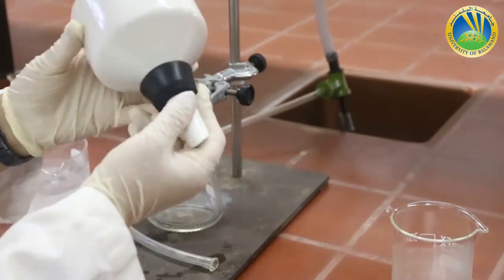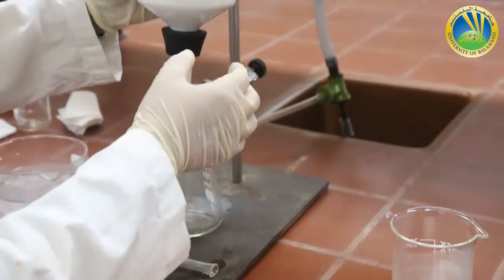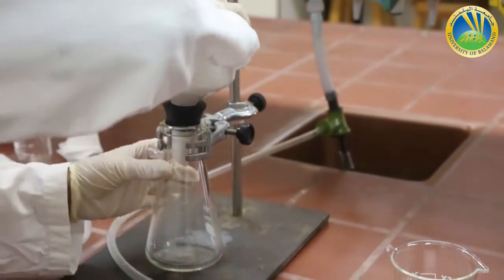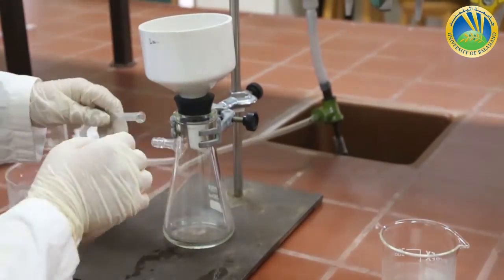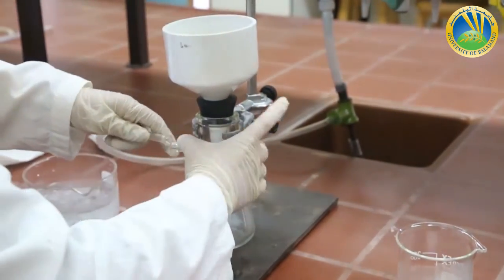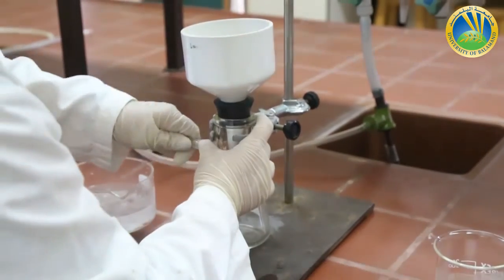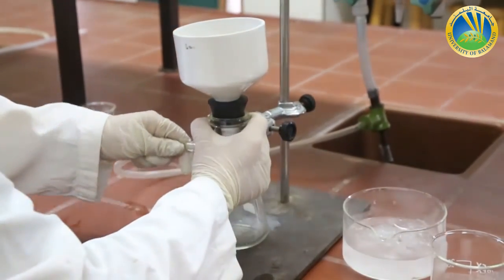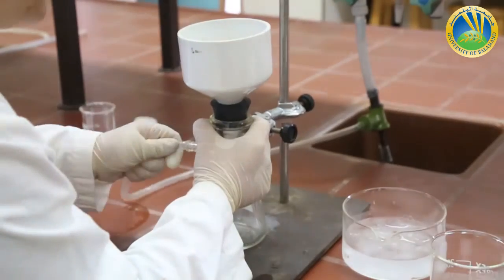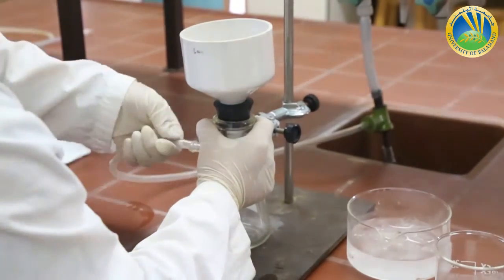Then I connect the funnel of the Erlenmeyer. I connect it to the vacuum. Like this.